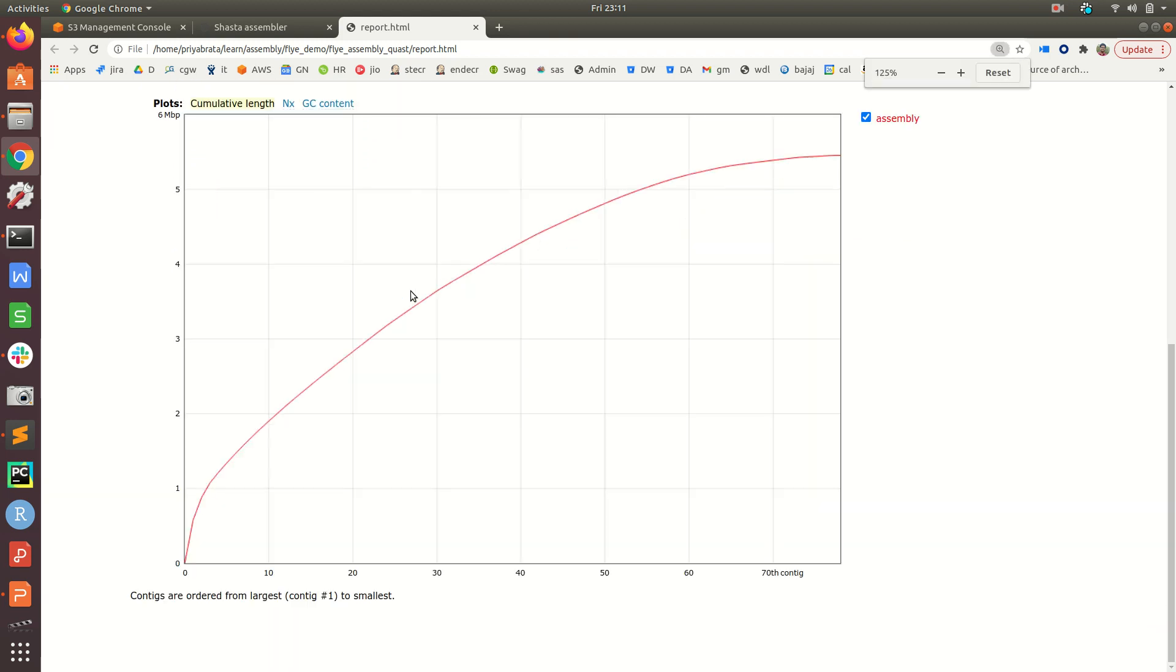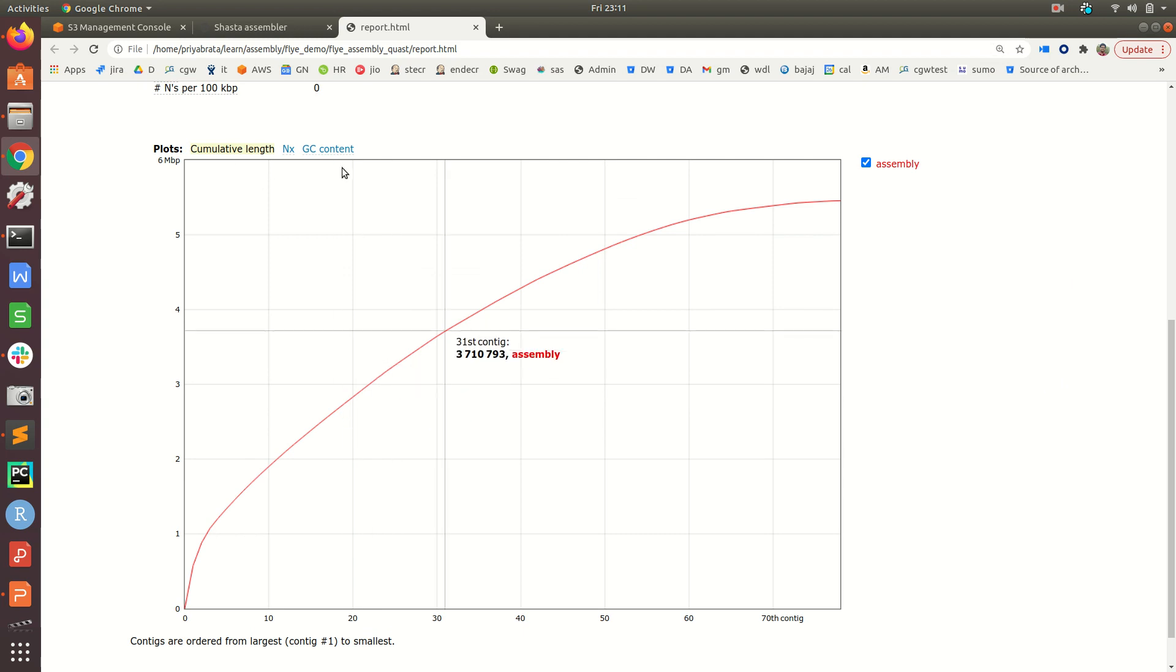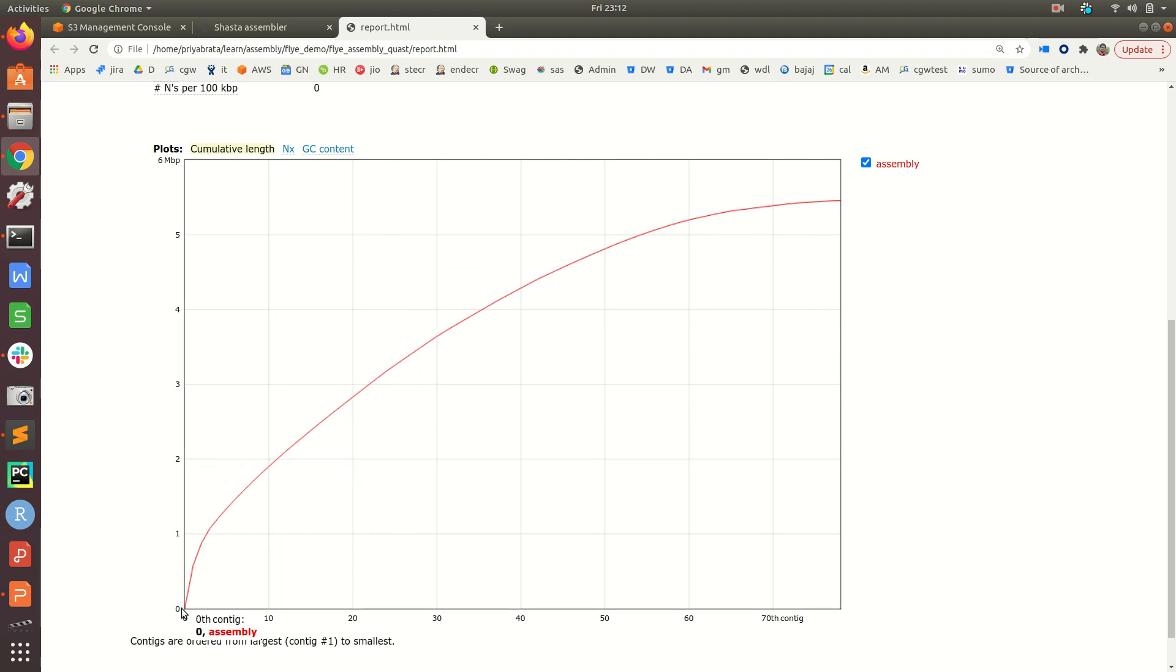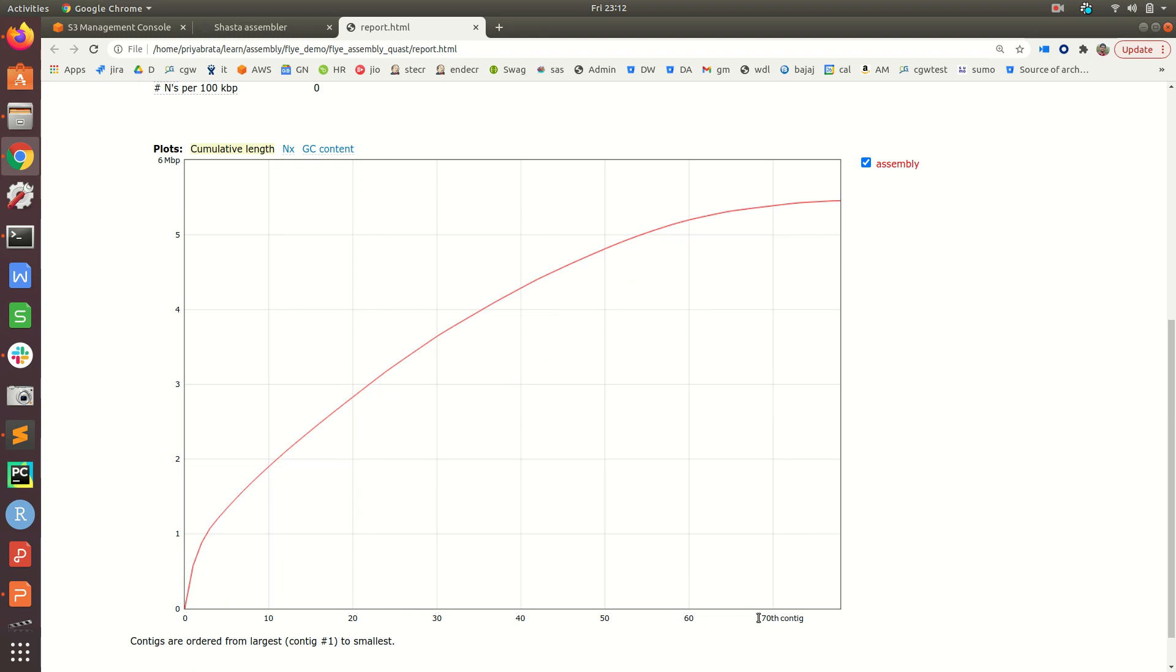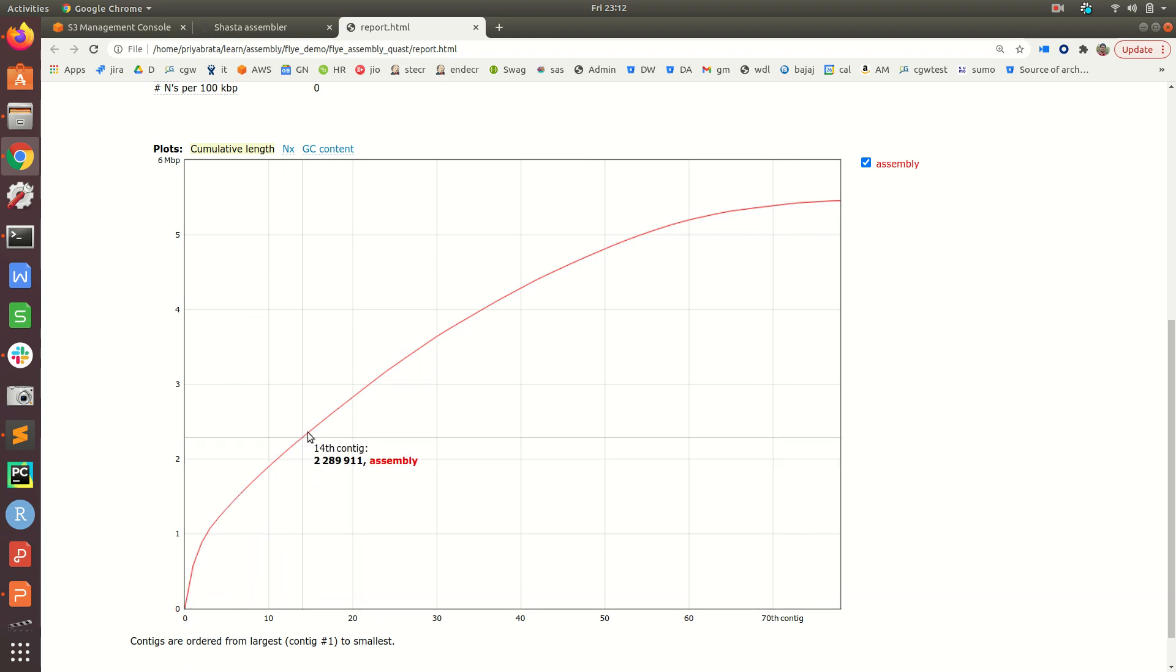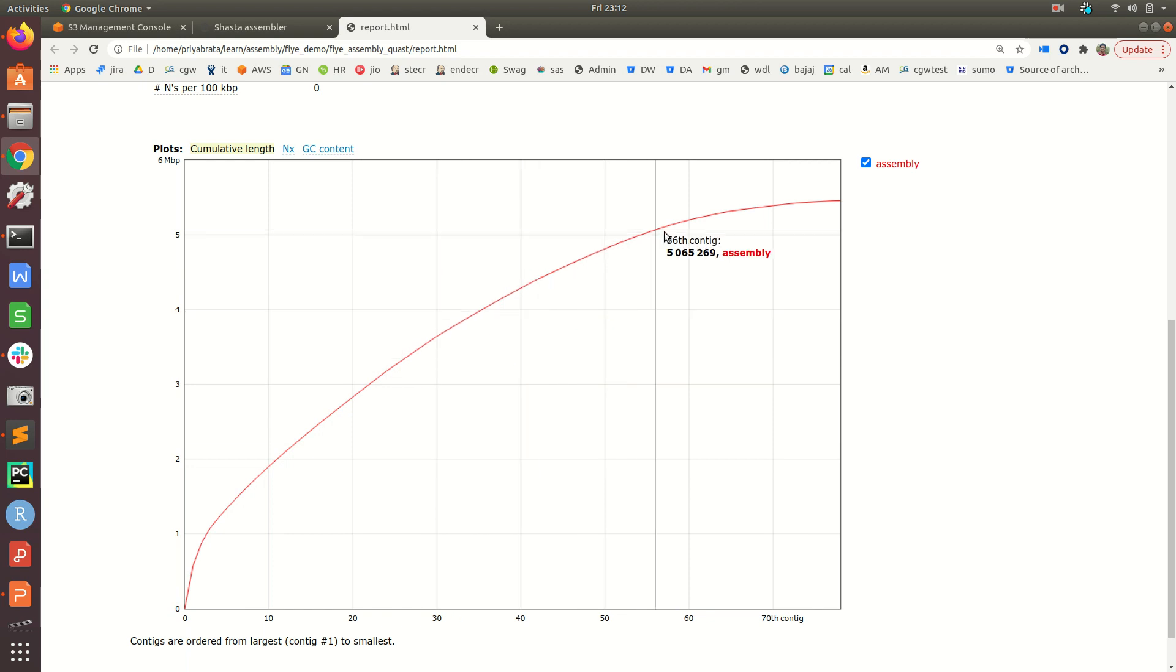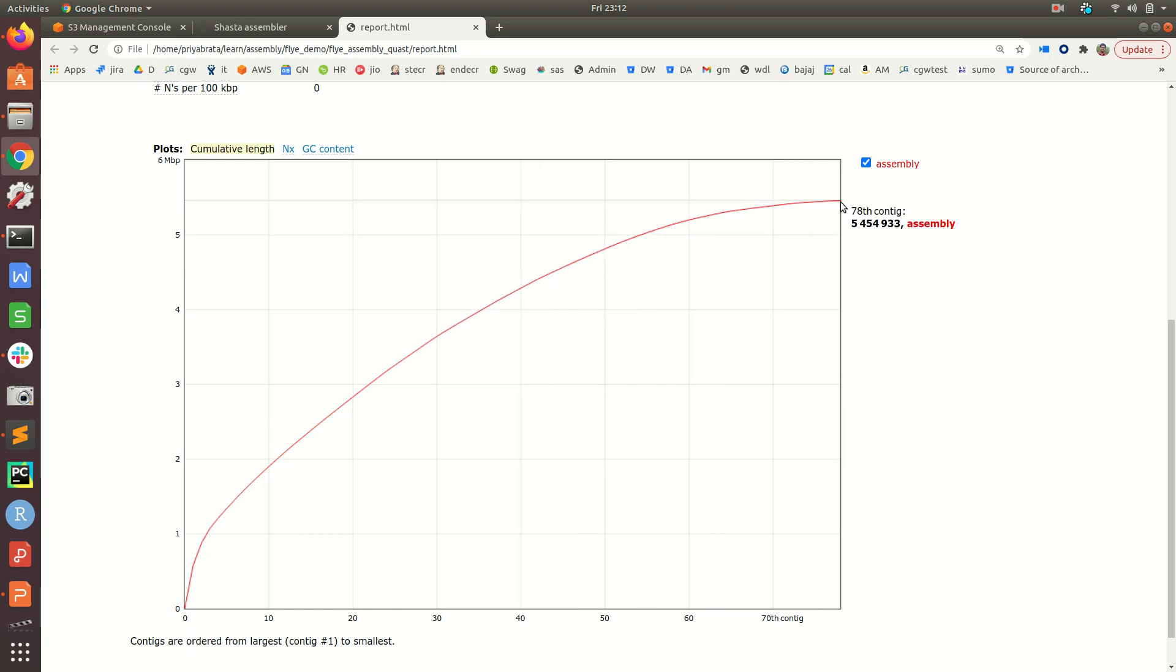QUAST also summarizes the above parameters in the form of different plots. Here the first plot is the cumulative length plot where the x-axis represents the different contigs. We have 78 contigs, and if we keep adding the contigs together, finally this is the total assembly size when we add all 78 contigs.